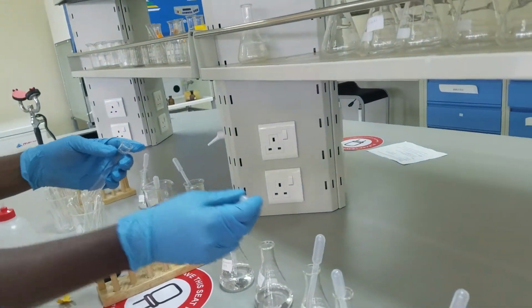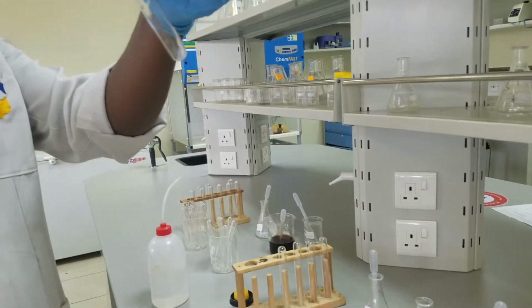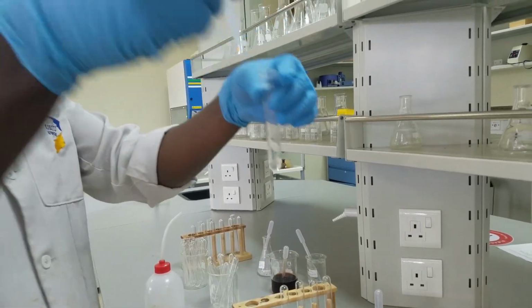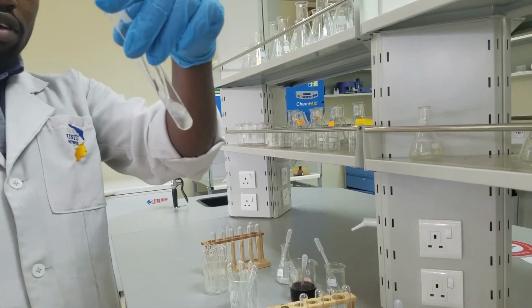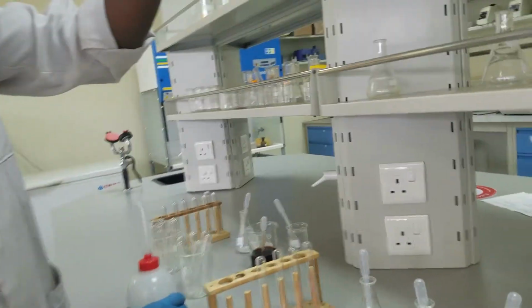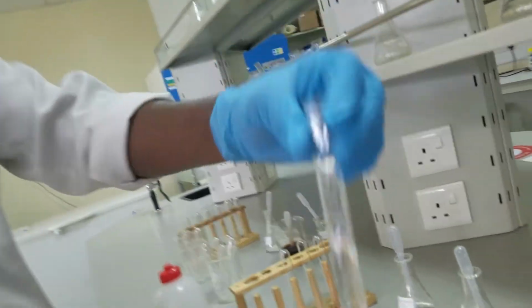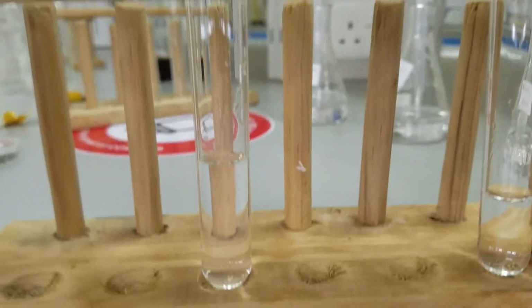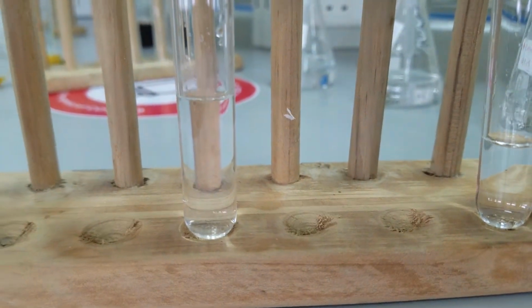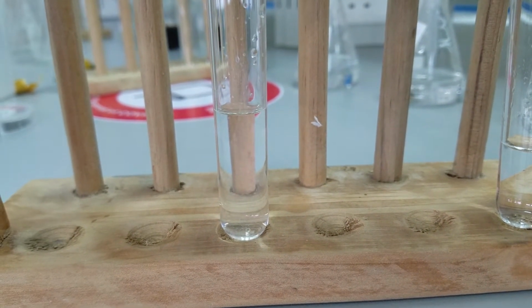That's fine. I'll go to the second one. This is acetone, and then add distilled water. Check and record the observation.